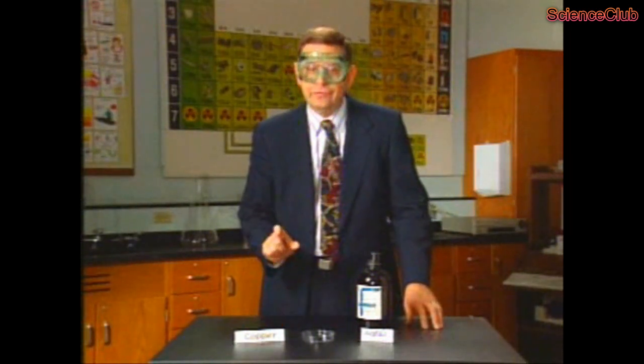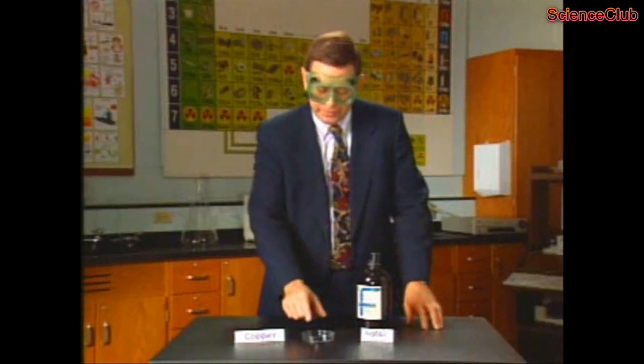To demonstrate the copper-silver oxidation-reduction reaction, we're going to place a piece of copper wire in a petri dish and add silver nitrate solution to it. Here we can see the silver crystals beginning to grow, causing the copper wire to look gray and fuzzy.